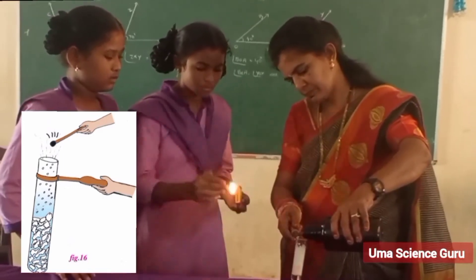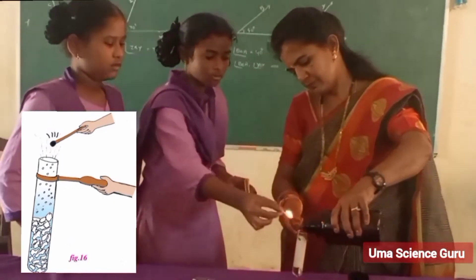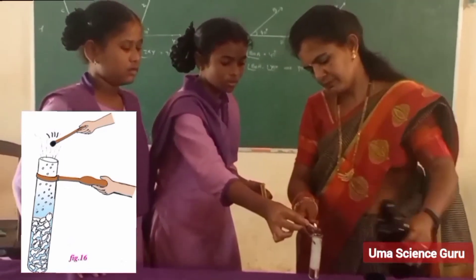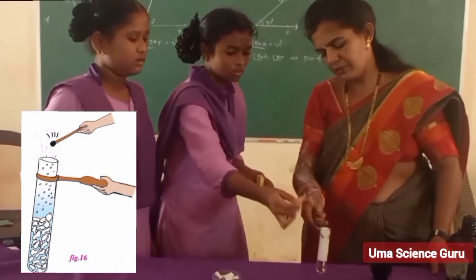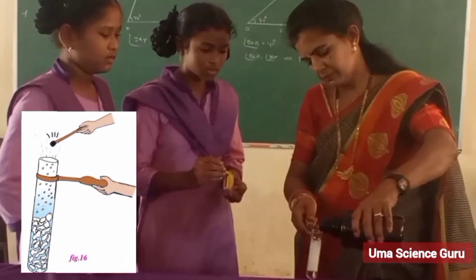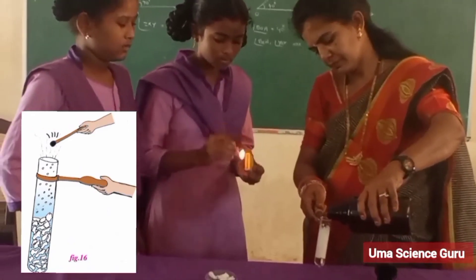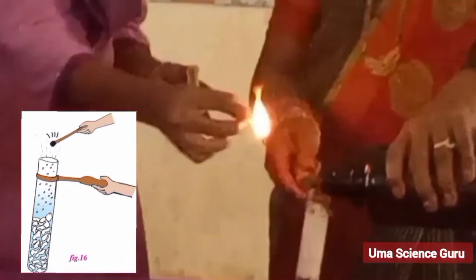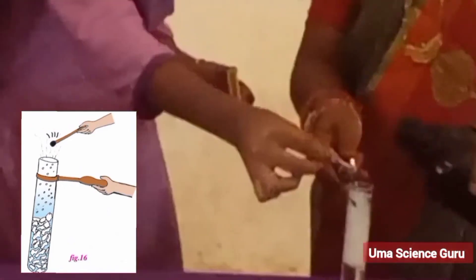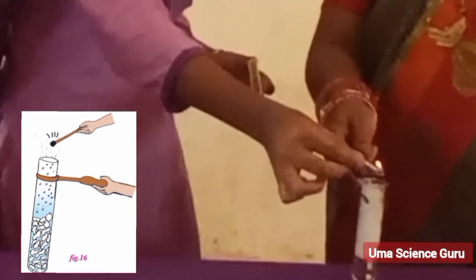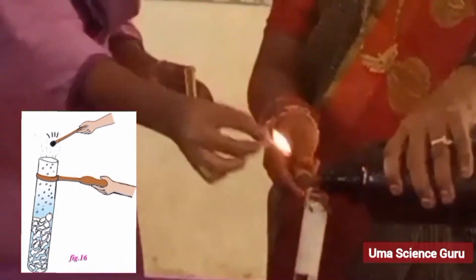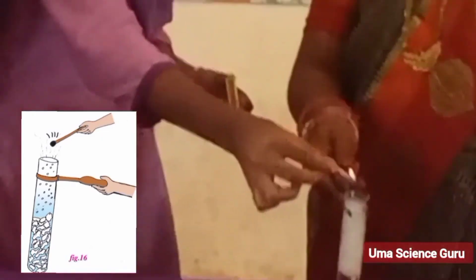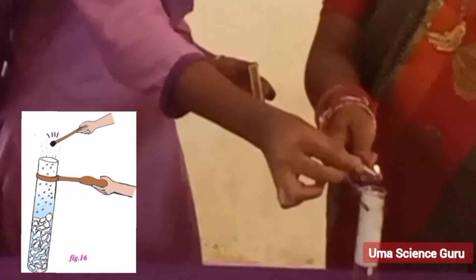Students, do you observe any gas released in this reaction? Bring a burning matchstick near the mouth of the test tube. What happened? The gas that put out the burning matchstick is carbon dioxide.